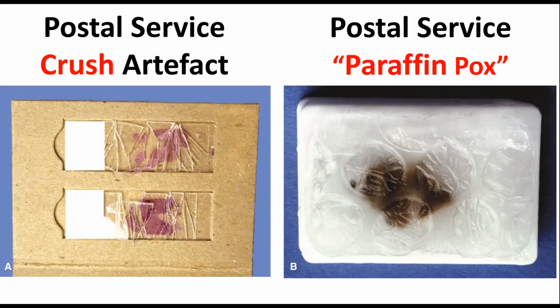All right, that's soul killing, but it did not prevent us, myself and my mentor, Dr. Peter Berger, from making that diagnosis. I call this paraffin pox.